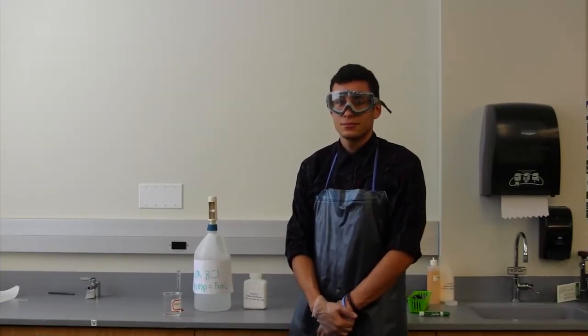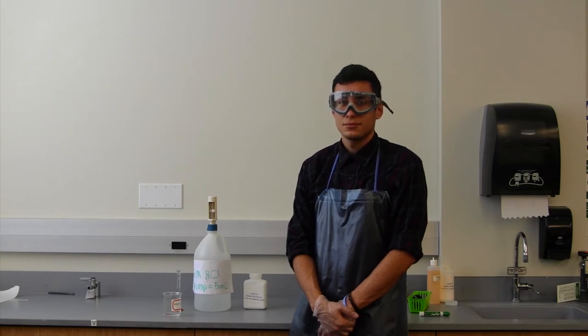Today we will discuss the true nature of a reagent pump, a nature not too familiar to the eager general chemistry student. Although you are bursting with potential, we would like to tame your vigor, for explosions in lab are not recommended.